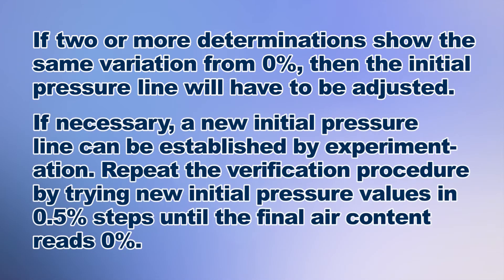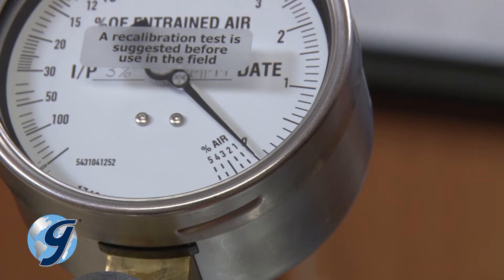If two or more determinations show the same variation from zero, then the initial pressure line will have to be adjusted. If necessary, a new initial pressure line can be established by experimentation. Repeat the verification procedure by trying new initial pressure values in 0.5% steps until the final air content reads 0%. Gilsen recommends verification of the initial pressure line each time the air meter is calibrated.